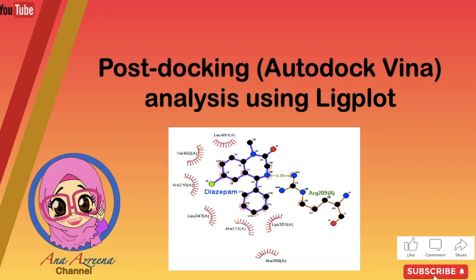Hi and assalamualaikum. Today I will share with you all the post-docking analysis from Autodock Vina using Ligplot.